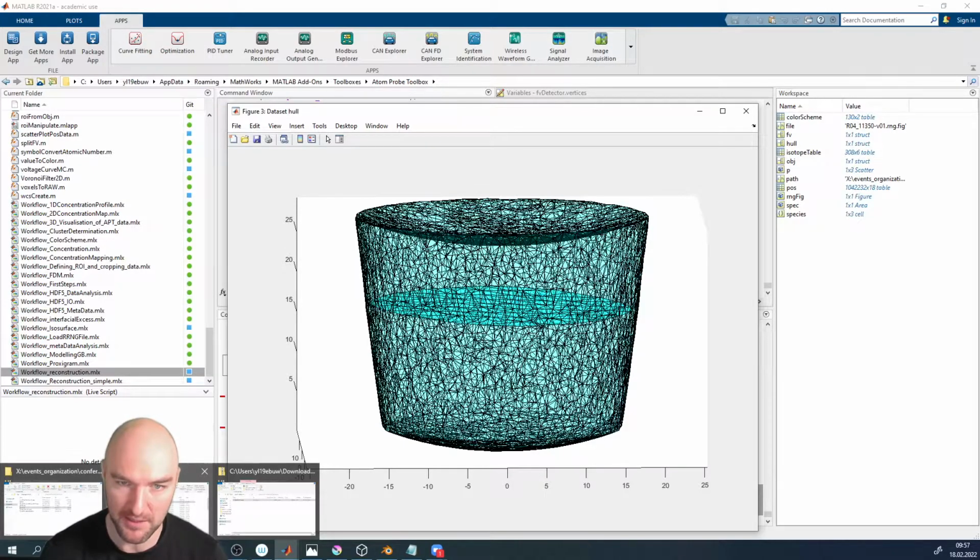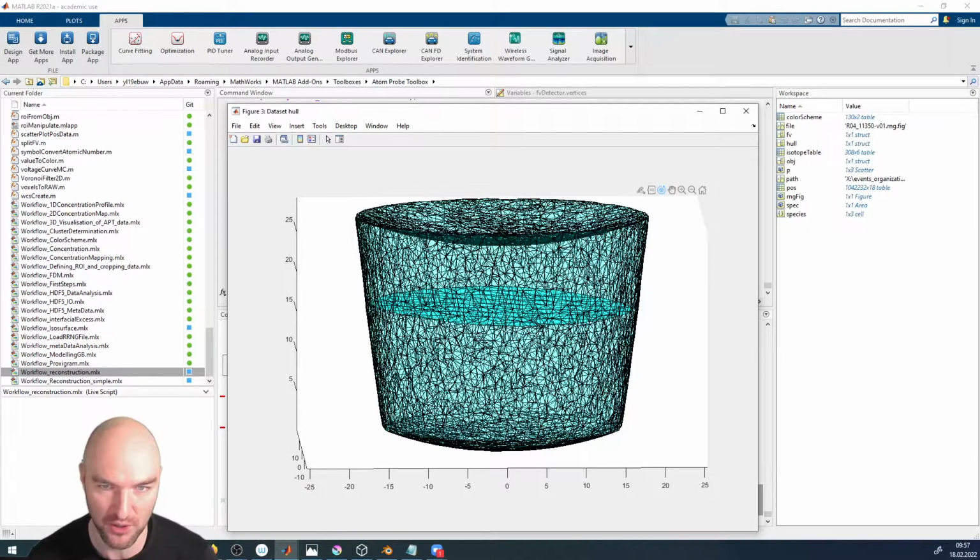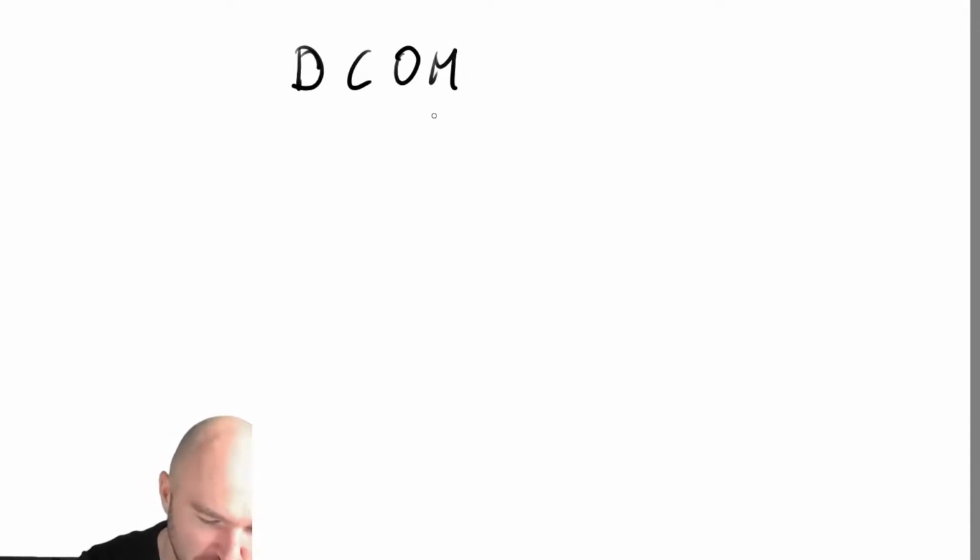So we have developed an algorithm here that is essentially as simple as using an isosurface to create a grain boundary, but that one would really need to be recoded to be easily usable. But what we can do is we can take our initial model here, and we can snap the vertices to our atomic positions. And what I mean by that is a very simple algorithm, which is called the distance to center of mass algorithm. And it's actually a very simple thought.